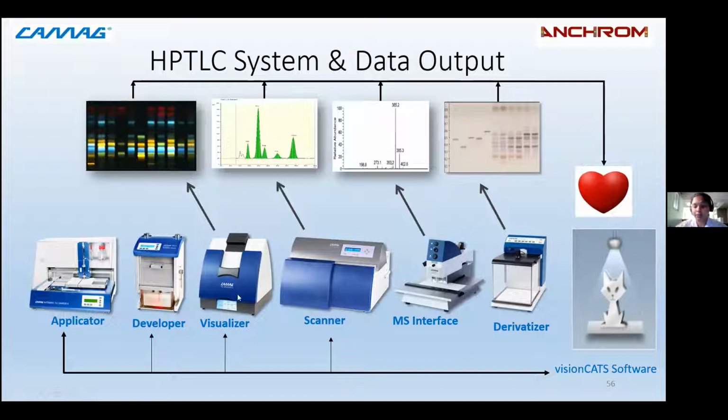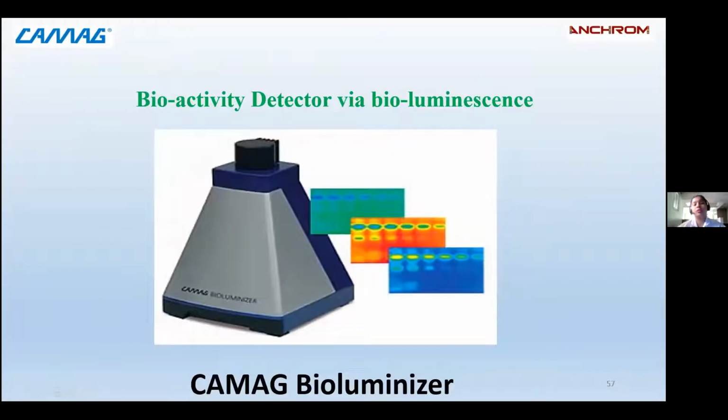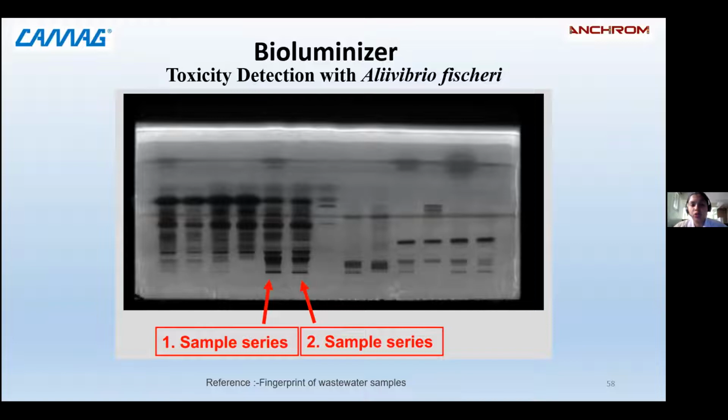So this is the whole new concept of bioactivity, the CAMAG BioLuminizer. It is mostly used for toxicity studies, which are done mostly for APIs in clinical trials. So this is an example of a toxicity study for wastewater.